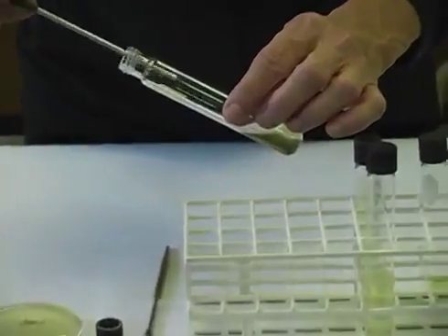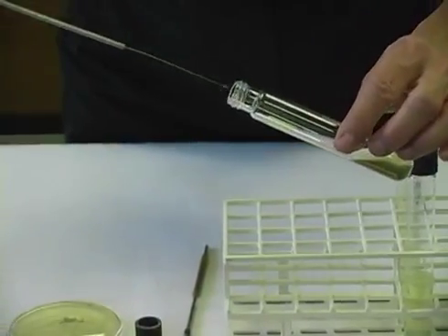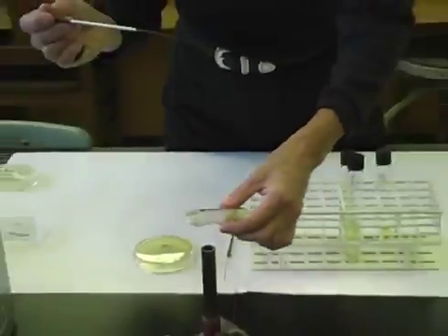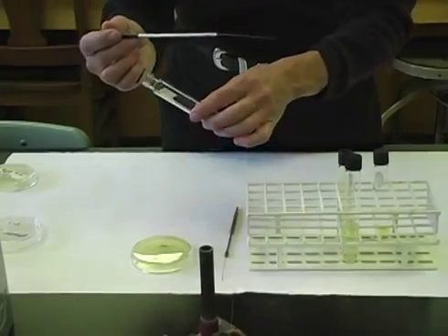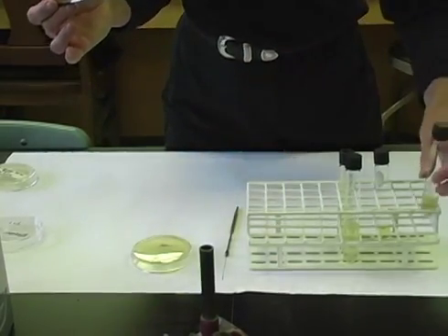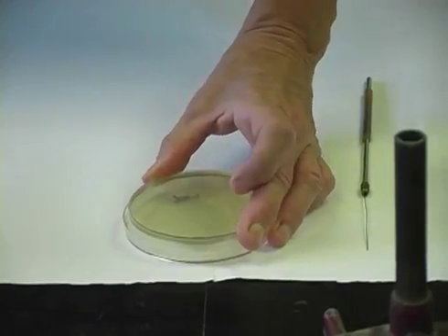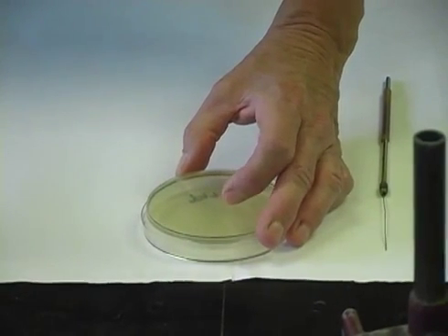I heard the loop hiss and spit. That told me my loop was too hot, so I held it in the broth, shook it a little bit to make sure I have some living microbes present on my loop, to transfer my microbes to the surface of my agar plate using a 4-quadrant streak technique.